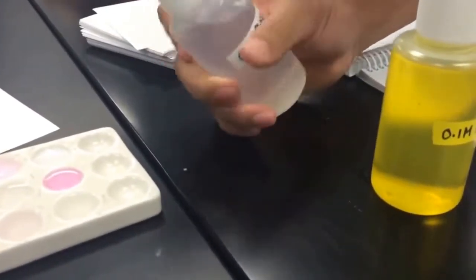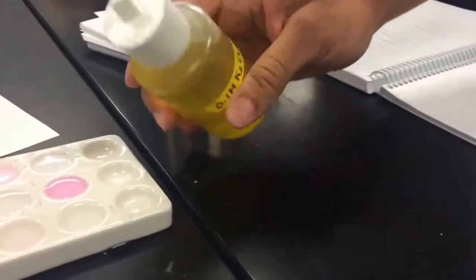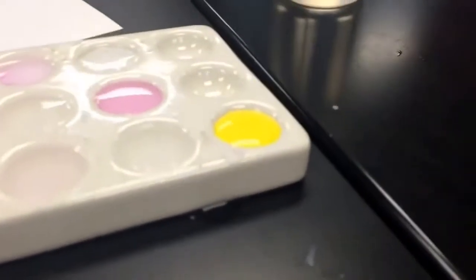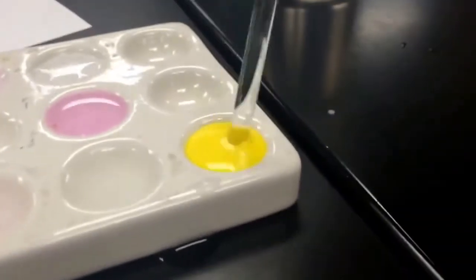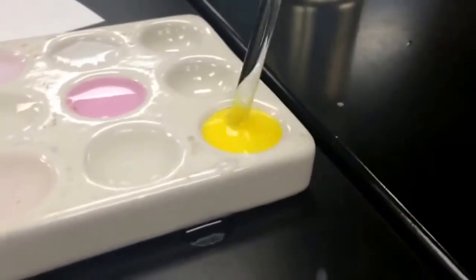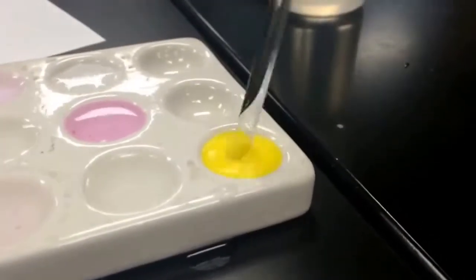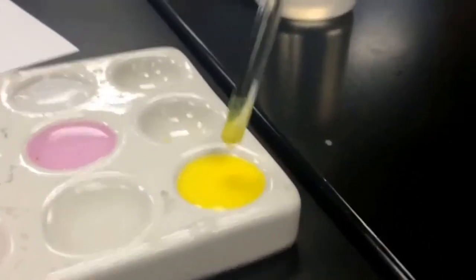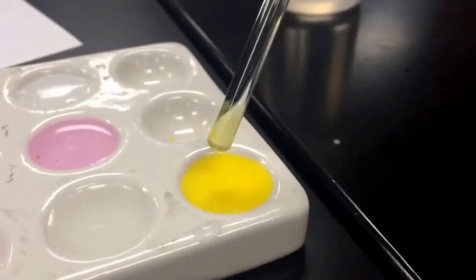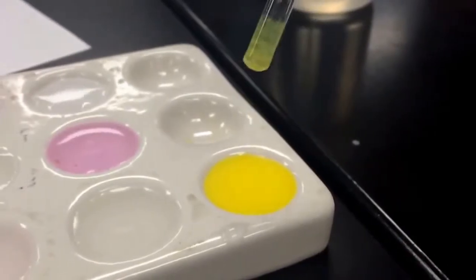So here's the lead nitrate. And here's the potassium chromate. Yellow. There you can faintly see some dots, some precipitate. However, they're not as clumpy as before, as number 9. There you go.